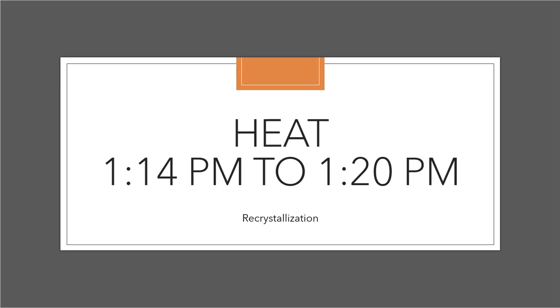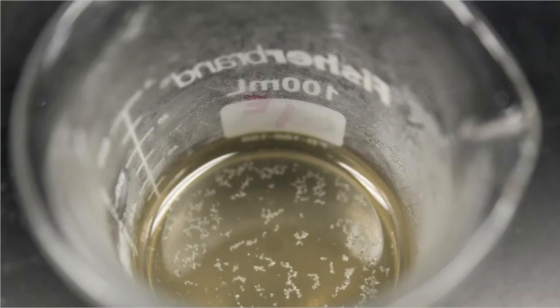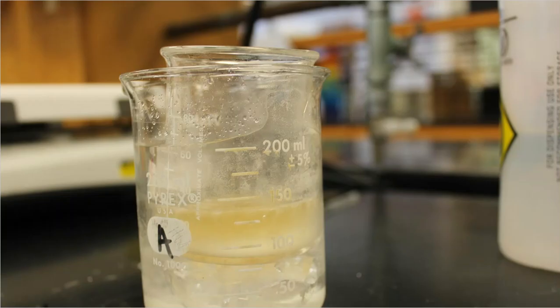Well, I poured it through a filter to get rid of all of that crud. And when I did, it went into a beaker, and I automatically started to see crystals begin to form. Look at that. Well, the directions tell me to put it in an ice bath, so I did. I put that in an ice bath and let it sit and chill out for a while. So there are your observations in the ice bath.